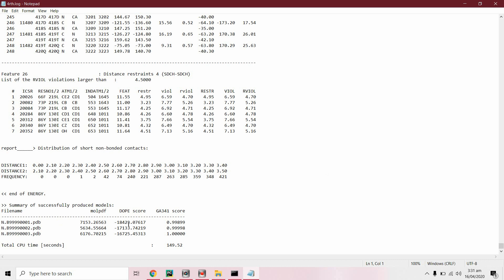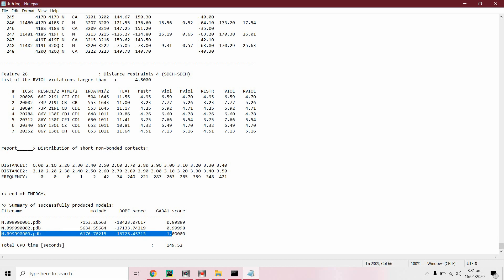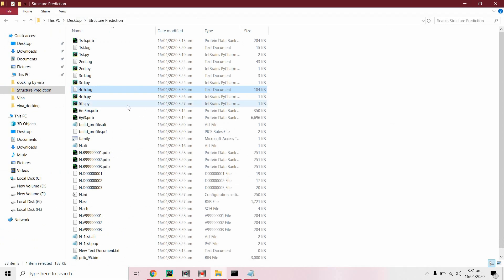The model with the lower DOPE score will be better than the others. The third model has the lowest DOPE score, so we will evaluate this third model. We will edit the fifth script accordingly.